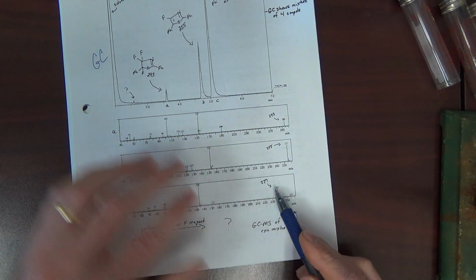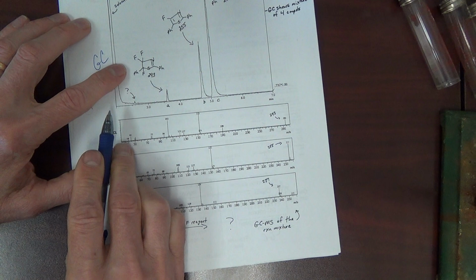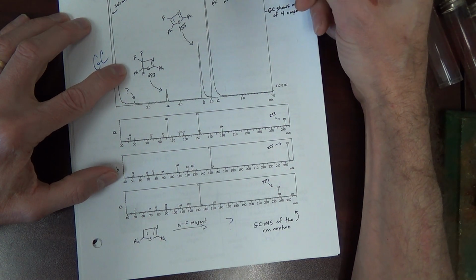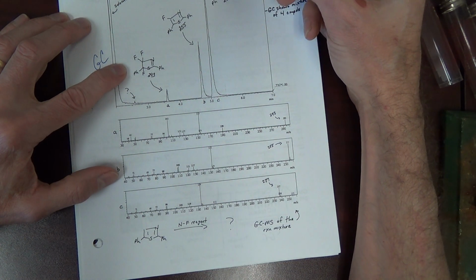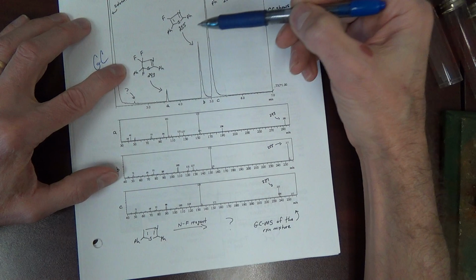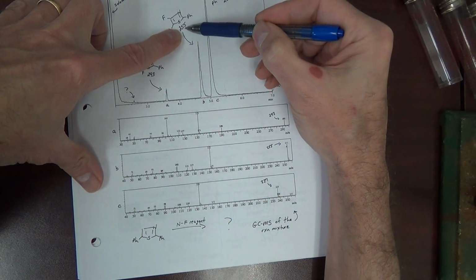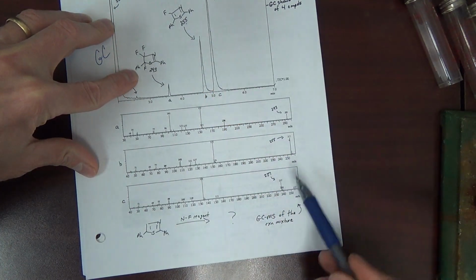Looking at molecular ions, we were able to tell that this was this molecule. This was actually the starting material of our reaction. What we were doing, we were trying to fluorinate this ring. We did the reaction. The product mixture still predominantly showed starting material, but the reaction mixture also showed presence of a monofluorinated compound, which would have a mass of 255. It also showed presence, unexpectedly, of 3 fluorines, which was a mass of 293.